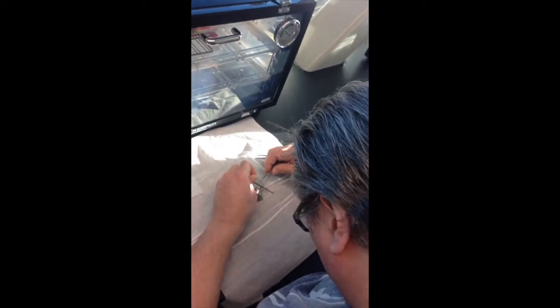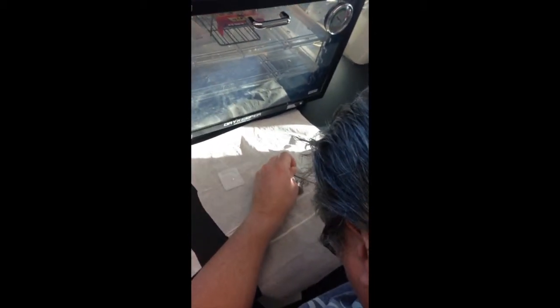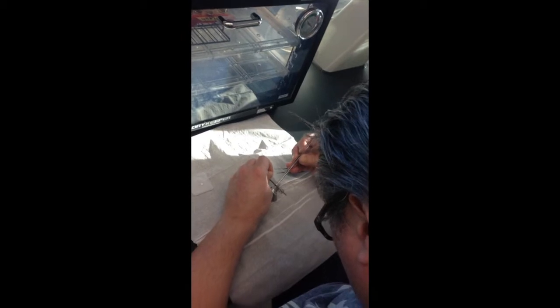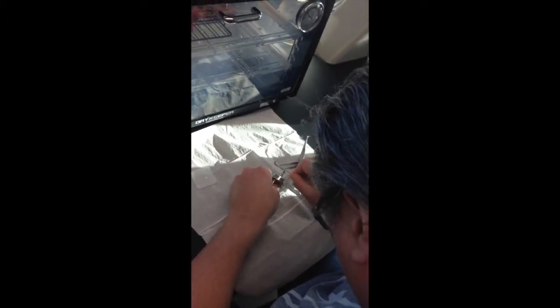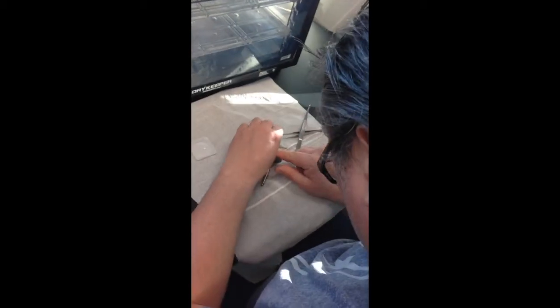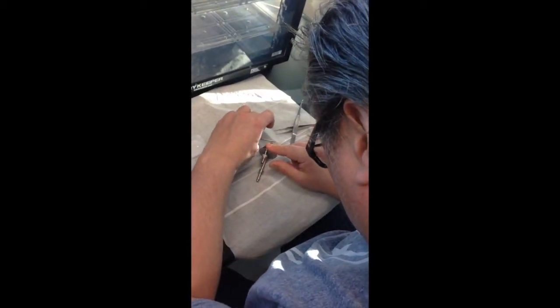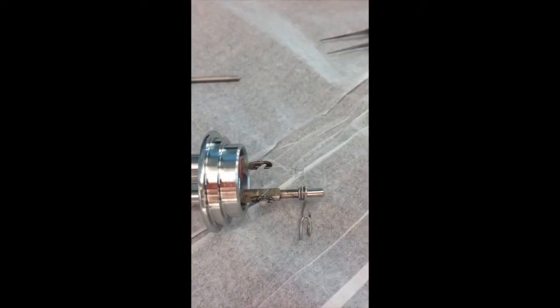Try to even out the spacing of the loops while loosening the fuse from the allen wrench. Begin to slide the wrench out. This is what a properly wrapped fuse wire looks like.